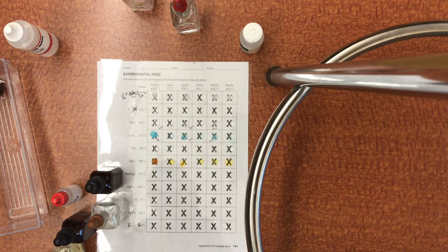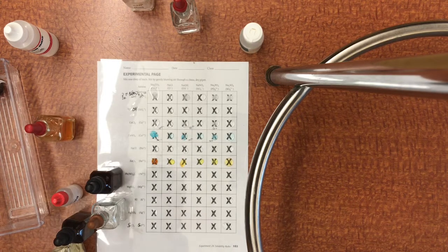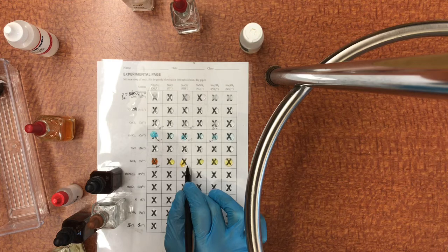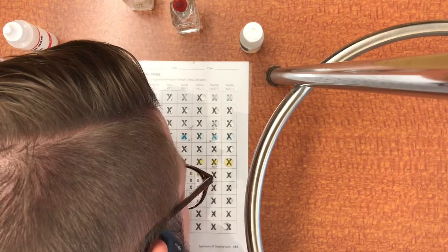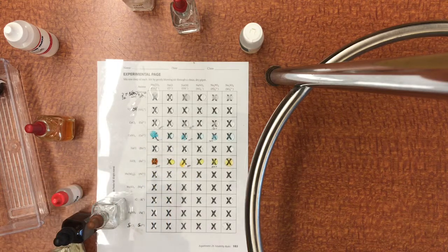So it looks like only the phosphate had a slight reaction, but really the strongest reaction was definitely that carbonate. So iron carbonate, definitely a precipitate here. And I also see a precipitate in the hydroxide. Looks like I can see it here. When I get really close to it, I can see a little bit of cloudiness. Sometimes you can take a little toothpick and stir them around, see if there's any extra reaction that you can get through a little bit of stimulation.